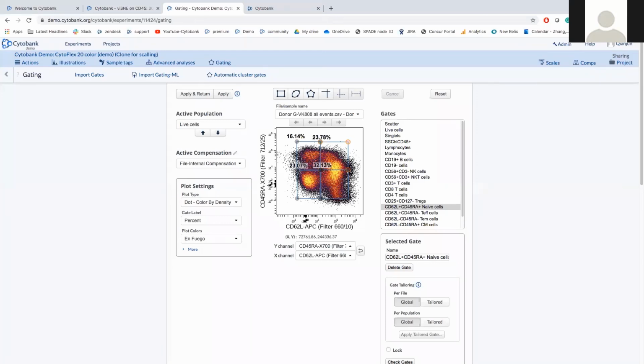Okay, let's move on to the next question here. There's a few questions with regard to when you upload the data and you accidentally include the wrong files, or you have a duplicate in your FCS file. So how can you remove or delete that?